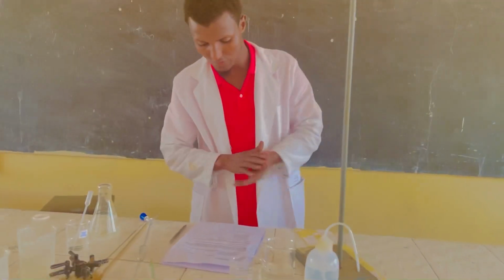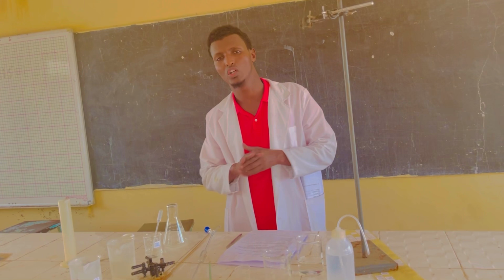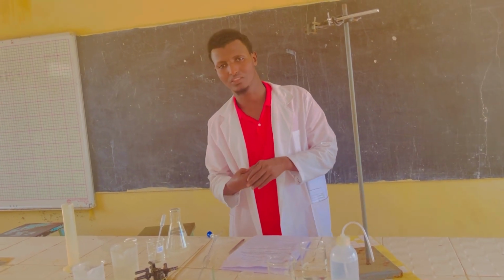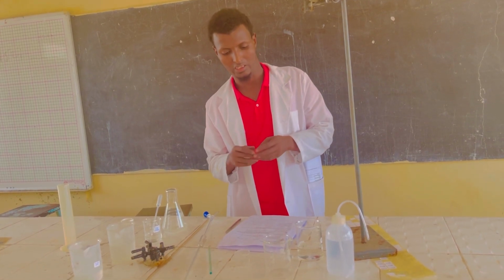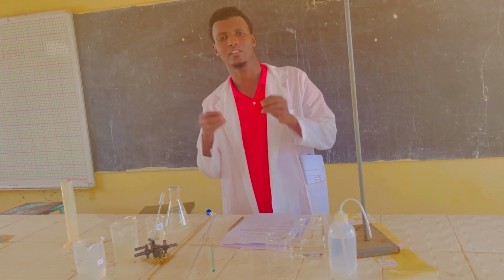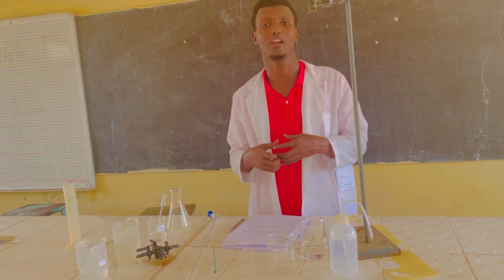Now solution W is the solution which contains 60 cm³ of the hydrochloric acid plus an unknown mass of solid V, which is sodium carbonate, and then some water, which is 40 cm³ of water because of the topping up.